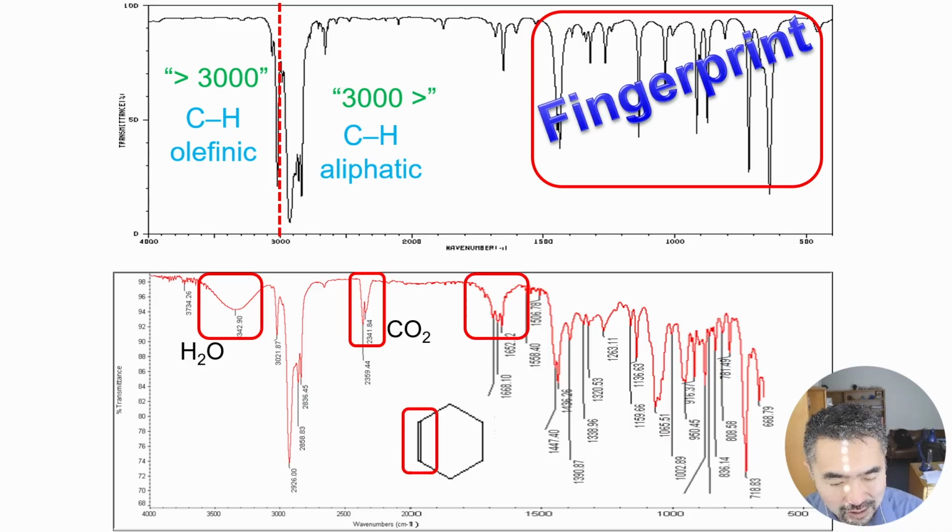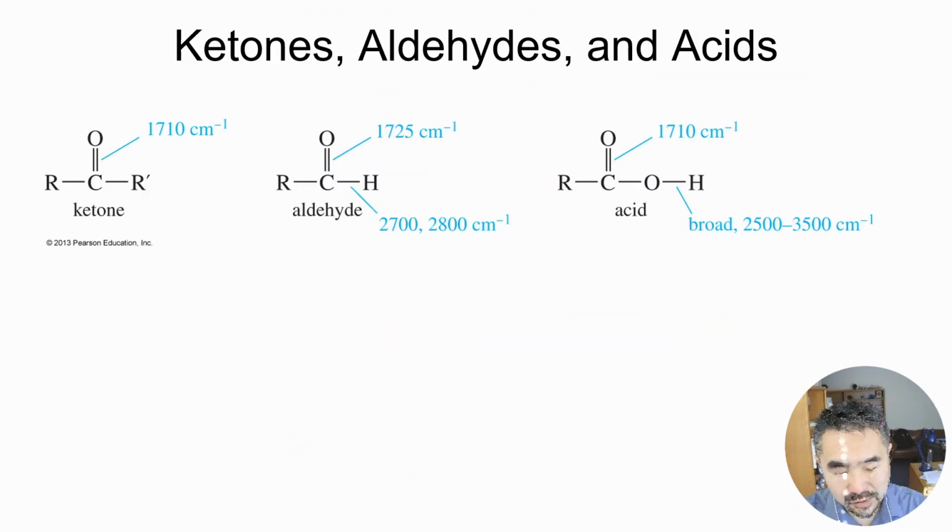Remember to always wash your glassware right after use, so it'll be dry by the next time you need to use it. The carbon-carbon double bond area looks a little bit different. Again, even though the wave numbers are the same among these three peaks and these three, don't base too much on what the appearance looks like, but look at the exact wave numbers because that's more trustworthy.